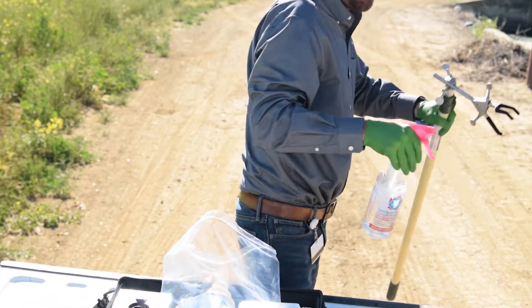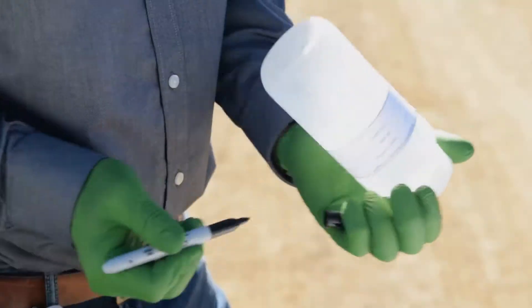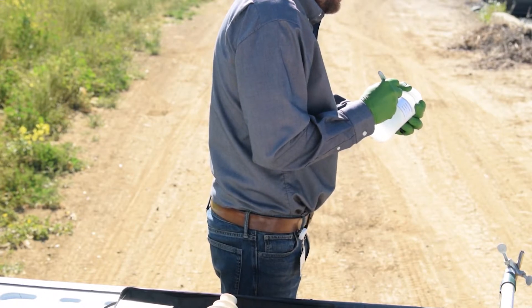Make sure to clean your equipment with alcohol before sampling. Use a sterile sample collection container, either a bottle or bag, that is sealed. Do not break the seal until you are ready to sample.